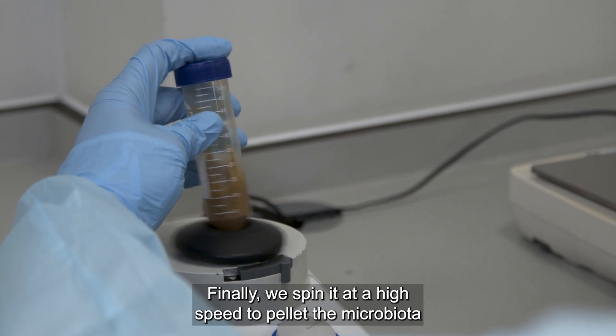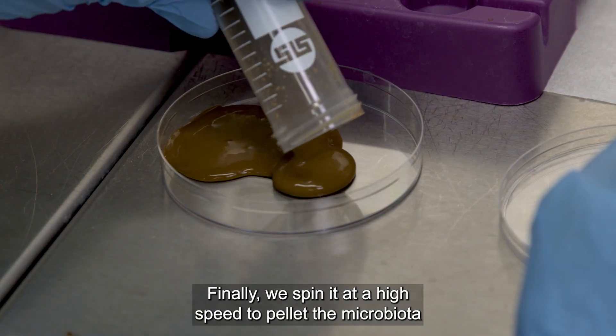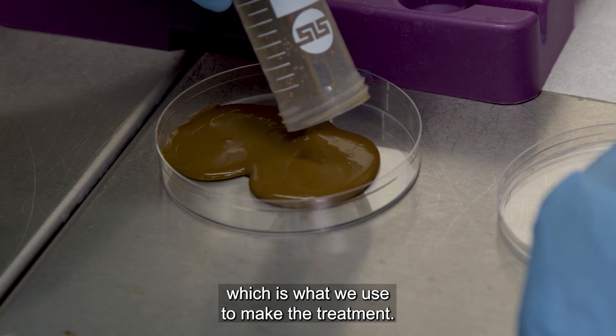Finally, we spin it at a high speed to pellet the microbiota, which is what we use to make the treatment.